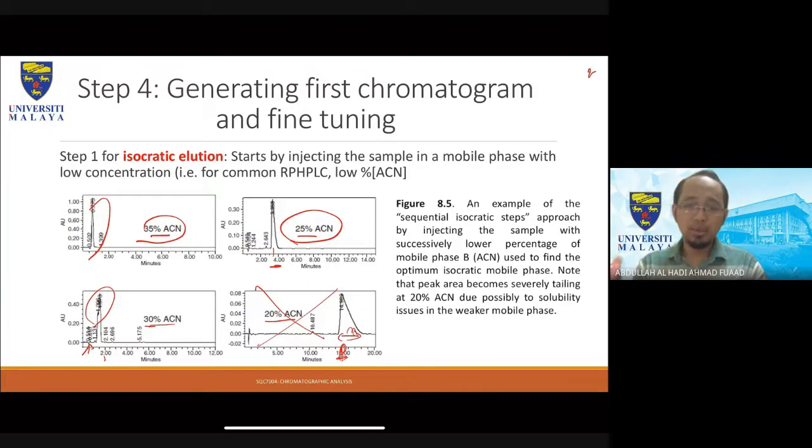And then from there, I do a comparison to look at how many impurities I can get, what my peak heights are, what the retention time is. So there's a lot of things that I do consider before actually running isocratic. But so far, I normally do gradient because gradient is easier, even though isocratic, as you can see here, might actually save a lot of time.